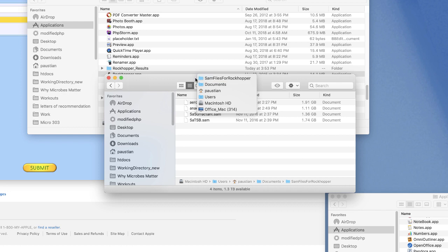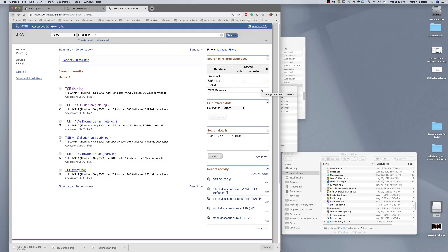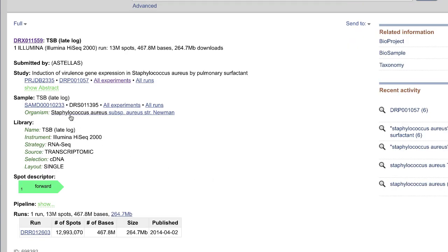These are RNA-seq data files under different conditions, and I have two here. The examples are from an experiment looking at what genes are expressed in Staph aureus — a known pathogen — in the presence of just TSB medium and then TSB plus surfactant. Surfactant is something you find in lung tissue, so it simulates what this organism would do inside a host versus just growing in TSB. The thought is we may find virulence genes. Before we map it, we have to know exactly what organism was used. If we click on one of the files, it tells us the organism is Staphylococcus aureus subspecies aureus strain Newman.